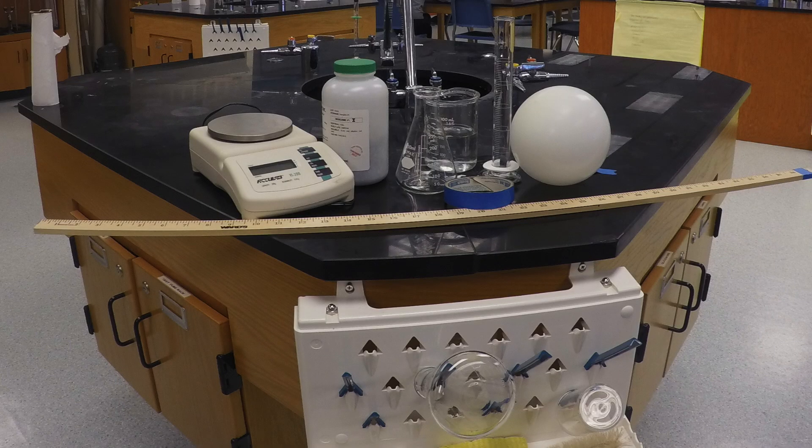Our materials consist of an Erlenmeyer flask, a Bunsen burner, hydrochloric acid, zinc, and a balloon.